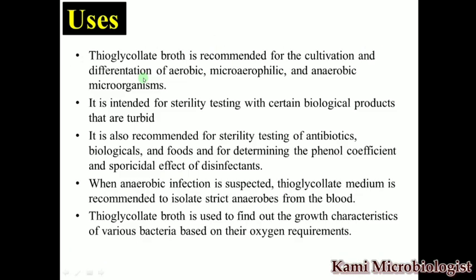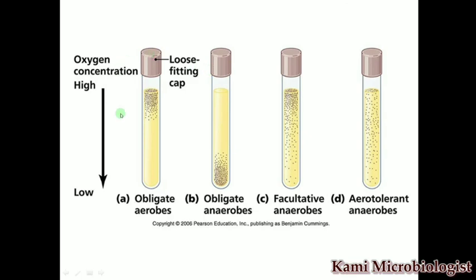Now this is how you can identify the bacteria, whether it is aerobic, anaerobic, or facultative. Let me explain. The first picture is showing turbidity at the top side.